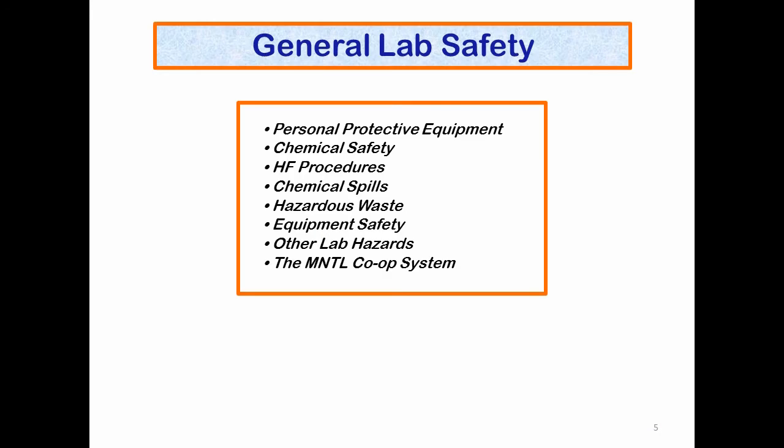General lab safety. We place a very high value on safety here, and we require all cleanroom users to use personal protective equipment, follow chemical safety and HF procedures very carefully, notify us of any chemical spills, or clean them up appropriately yourself.